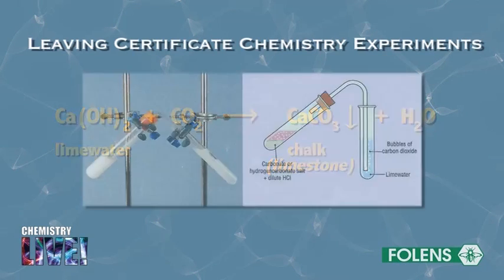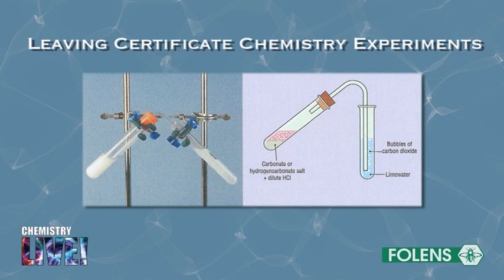You may recall that we have already carried out a similar experiment in mandatory experiment 6.1c when testing for the presence of the carbonate and hydrogen carbonate ions.